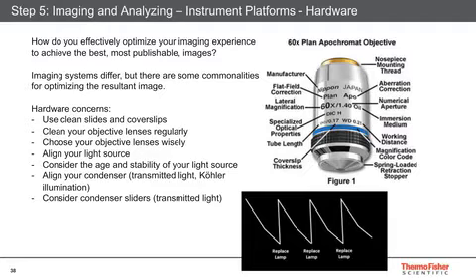First off, here you can see an image of a typical objective lens that's used in a microscope. There are a lot of different aspects in choosing an objective, but generally you want to go with the best possible objective. Usually an apochromatic or S-apo or super apochromatic is your best because it corrects for chromatic aberrations in color and planar aberrations. So it's all about getting an image that is nice and uniform and co-localizes between colors very easily. And of course, you want to consider the magnification. How high do you want to go? Using oil will give you a brighter, more resolved image, but of course, oil has its own issues. I won't talk too much about choosing objectives here beyond that.